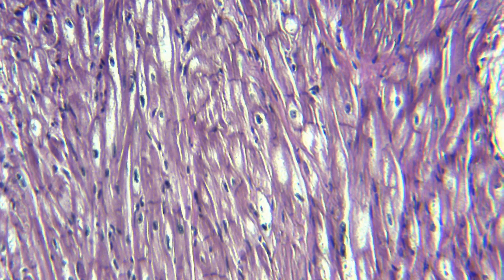When we look at it farther away, you cannot see the striations anymore. But if you look, you still see those darker side-to-side dashes — the intercalated discs.